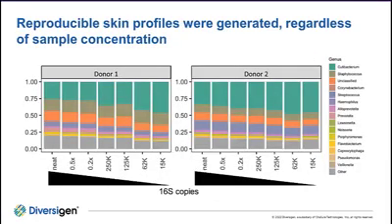In terms of the DNA input for analysis, it is important to find that sweet spot. So here at Diversigen, several different concentrations have been tested, and we have looked at how the bacterial taxonomic profiles change across the different concentrations or across a wide dynamic range. You can see here in this figure that with high DNA concentrations, there is also a higher 16S copy number. Yet, results show that virtually there are no changes in the relative abundances of the 15 most abundant bacterial genera across the different concentrations tested, suggesting that results are actually very consistent.